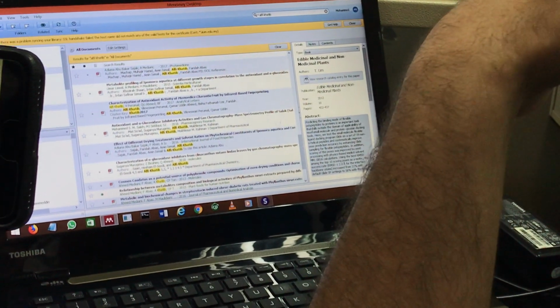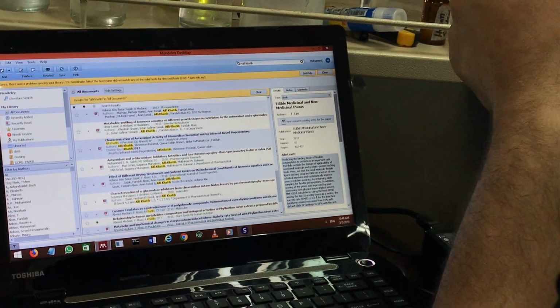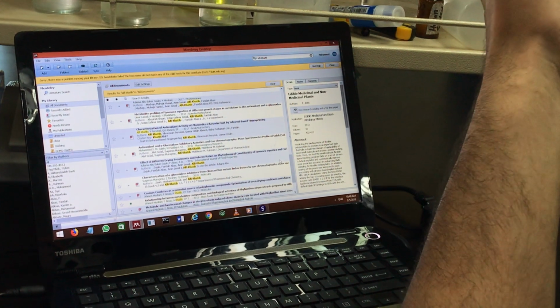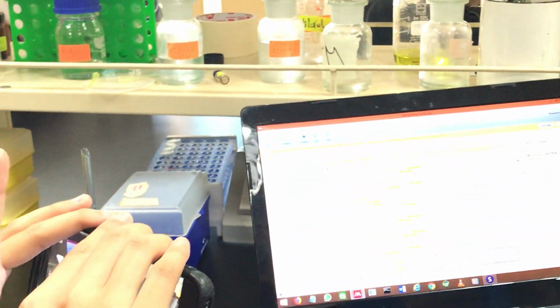Sometimes the water extract can be highly active and the ethanol non-active. Or yes, the ethanol can be very active and the water non-active. I mean, there is no standard, because we don't know what chemicals or compounds are in this plant. From plant to plant, it is very different.